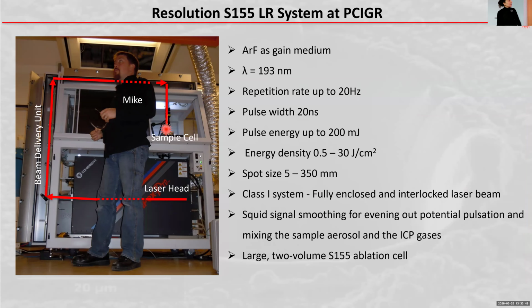So here are a few specifics, just if anyone wants to go back and watch the slides and see whether this laser is actually suitable for their samples. This specific laser is a very powerful laser. It was actually designed for the military, and then repurposed, luckily, to something useful. The pulse duration is in the 20 nanoseconds. It's, as I said, 193 nanometers.